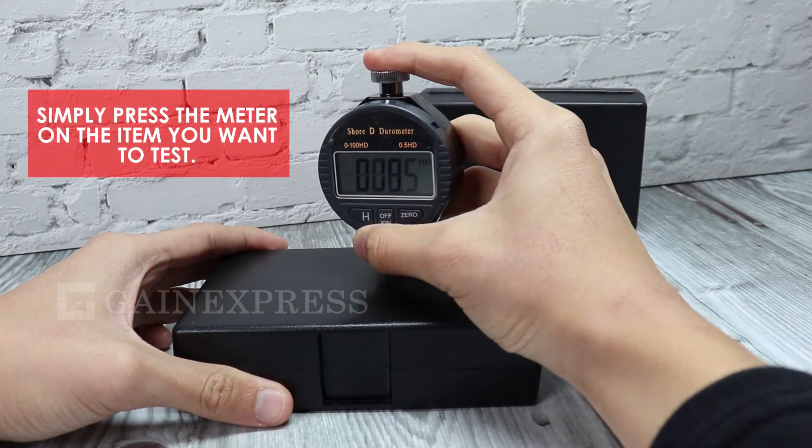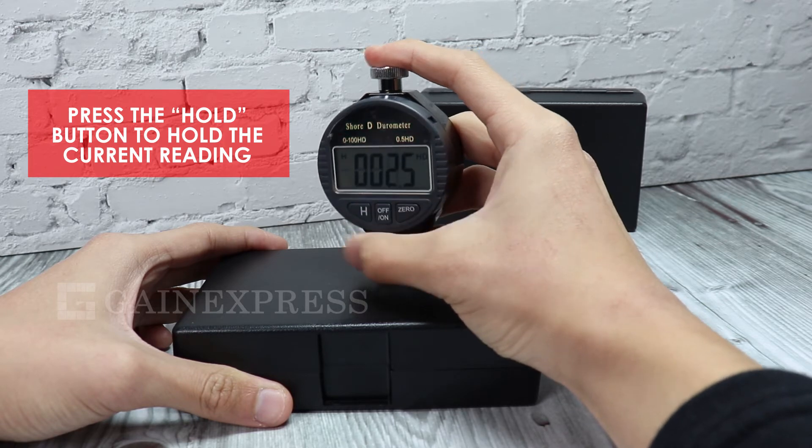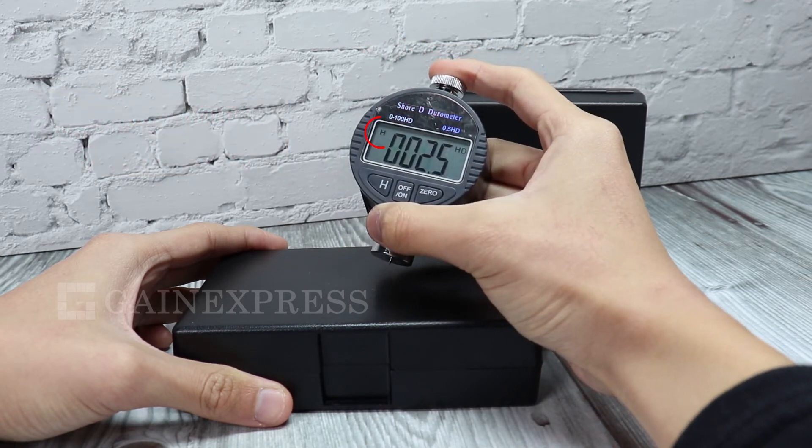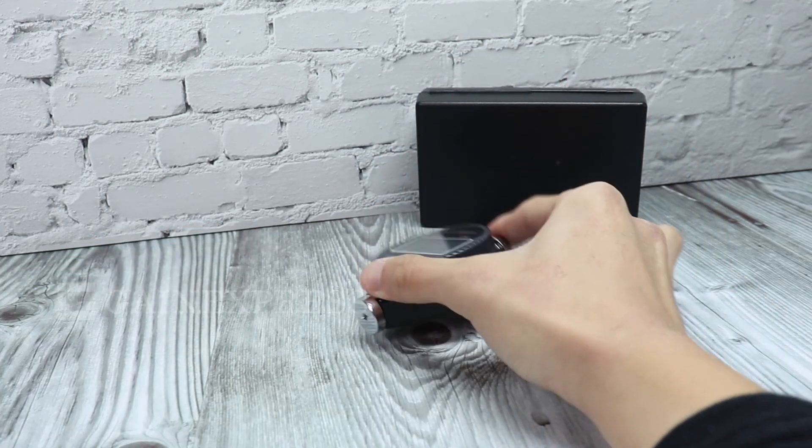To start measuring, simply press the meter on the item you want to test. Press the Hold button to hold the current reading. The H icon will display on the screen, indicating that the data hold function is on. Press the Hold button again to disable the data hold function.